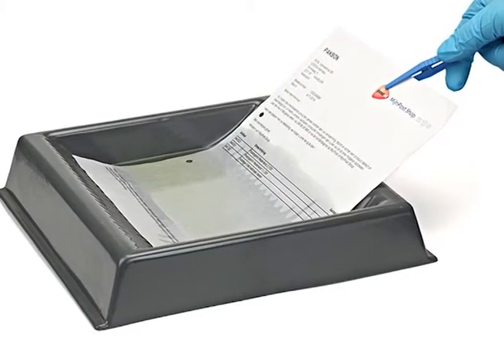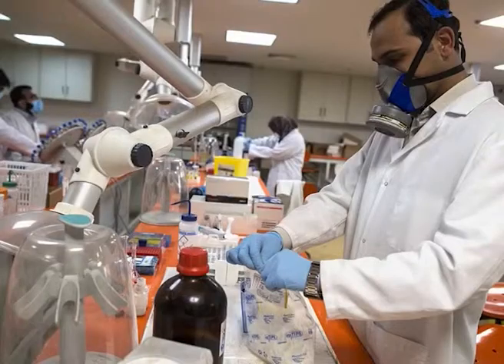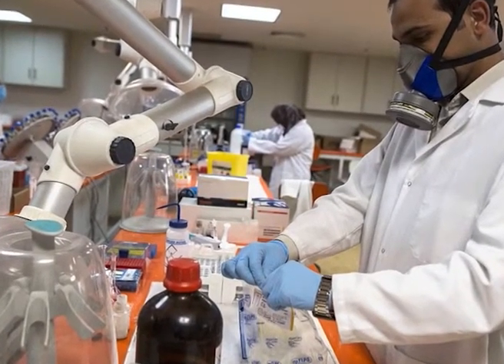Less conventional methods include exposure to Ninhydrin fumes, dusting with Ninhydrin powder or placing a paper dipped in Ninhydrin solution over the fingerprint impression. If development time is not a consideration, Ninhydrin spray documents should be allowed to develop at room temperature. This may take a few days, but the results are excellent. Normally, however, the surface is heated to 80 degrees centigrade so as to accelerate the development process. The mode of heating is also important. Heating may be carried out by a steam iron. Better results are obtained if the iron is moved from 1 to 2 centimeters above the surface. Most forensic science laboratories have adopted this procedure.